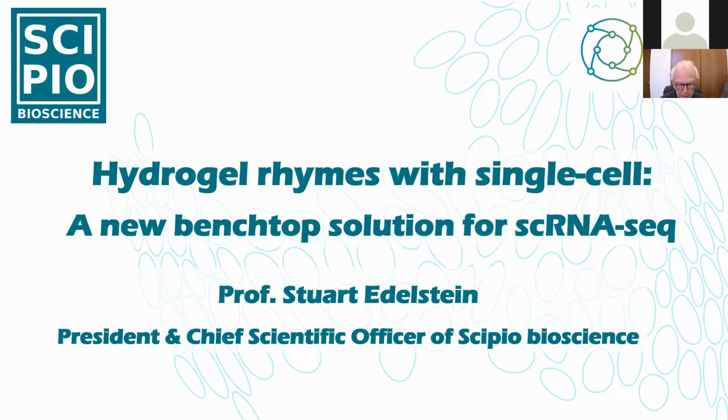When I began thinking about single-cell sequencing, I was motivated by two thoughts. One was that in biology today, it's clear that the focus has to be on the cell. And the other thought was that to make single-cell sequencing really available for researchers all over the world in all sorts of conditions, it would be great to have a kit that didn't require an instrument and could be available anytime people wanted to do an experiment. So that's how things got started, and I'll tell you today how we developed this project.